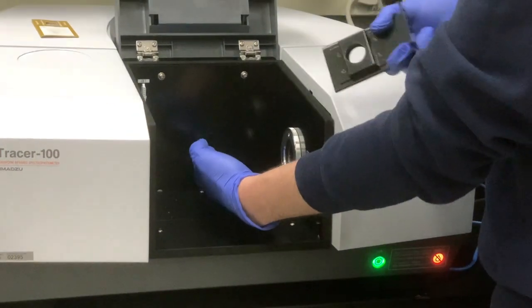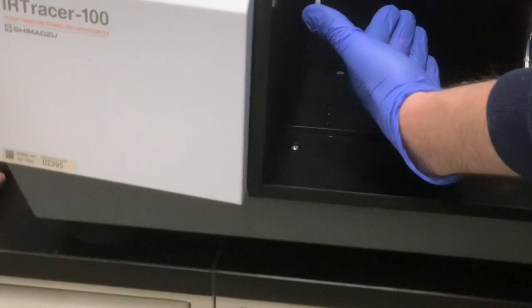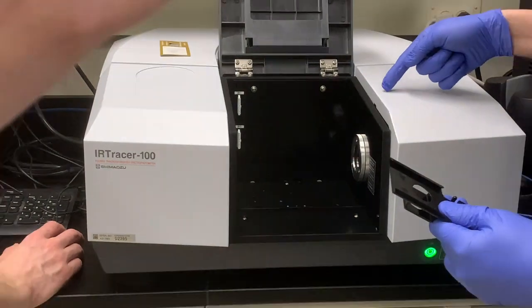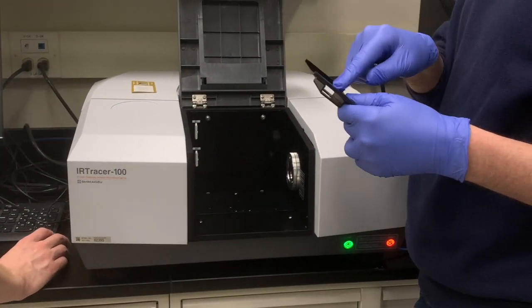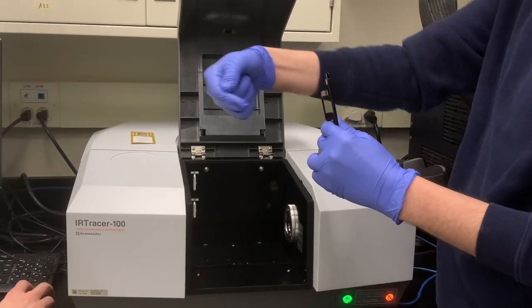You shouldn't touch it. If you see, this is infrared. Okay, so just have a look. Simply, the infrared goes through this center. It's not even covering that large area, only a center, a very small point. It's only the center because it should be transmitted. It should go through this way and come back here to the detector.